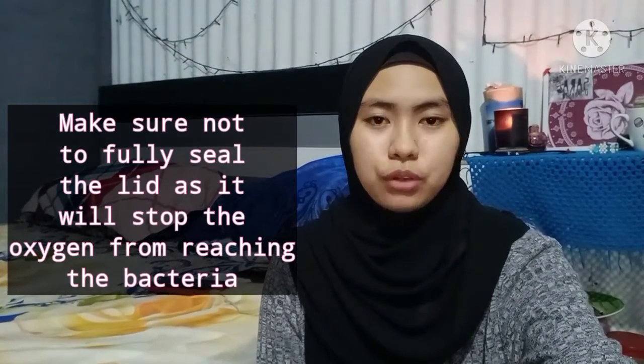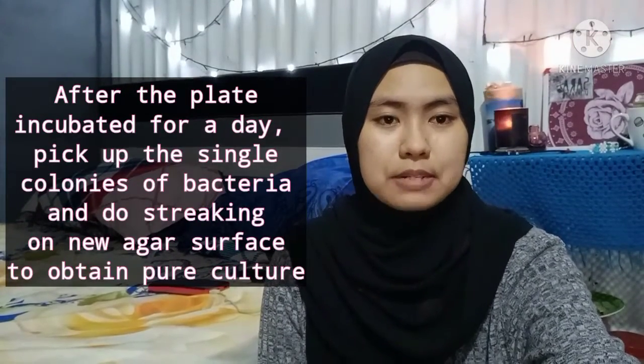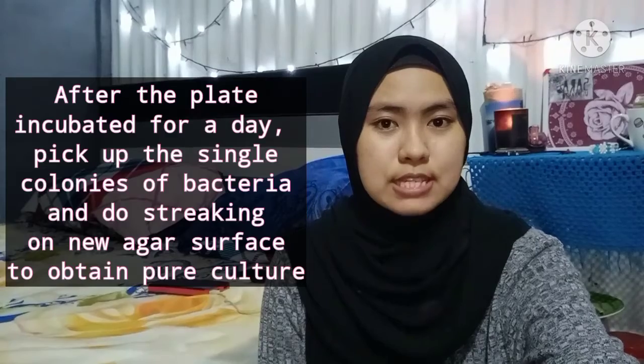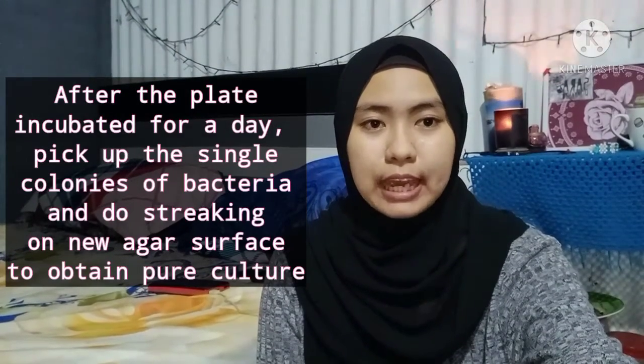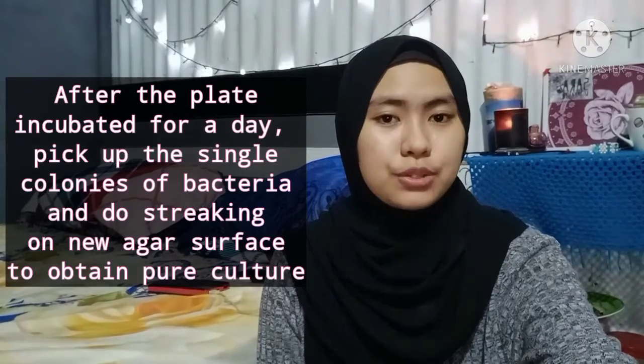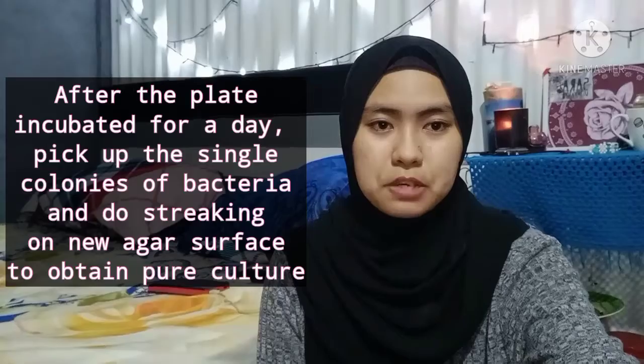as this will stop oxygen reaching the bacteria, and this may encourage harmful anaerobic bacteria to grow. Lastly, after a day of incubation, pick up a single colony of each species of bacteria from the incubated streak plate aseptically and do streaking on new agar nutrient plates to obtain a pure culture of each species of bacteria.